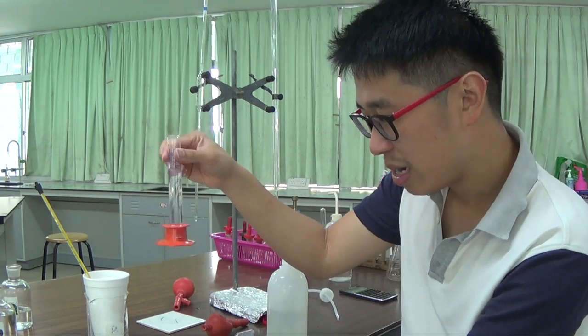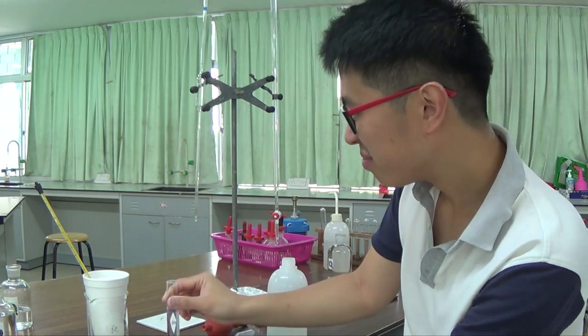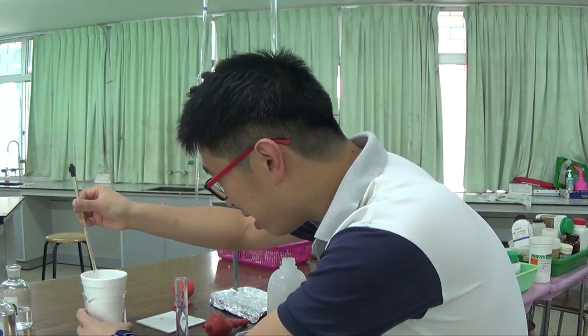Okay, so now it's 25.00 cm³. Let me just double check the temperature again.